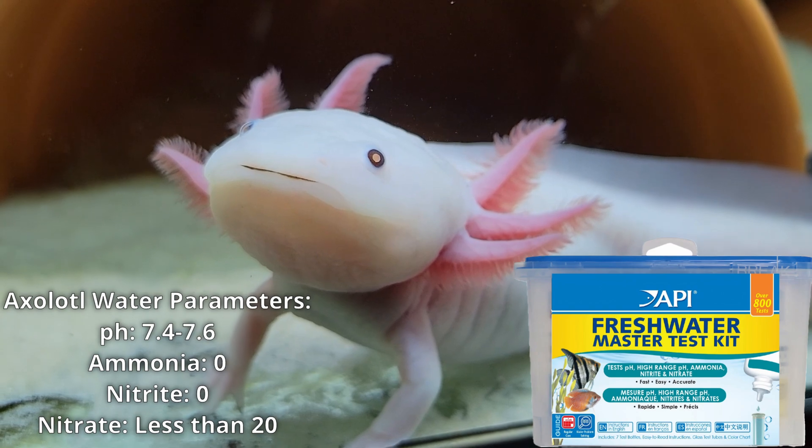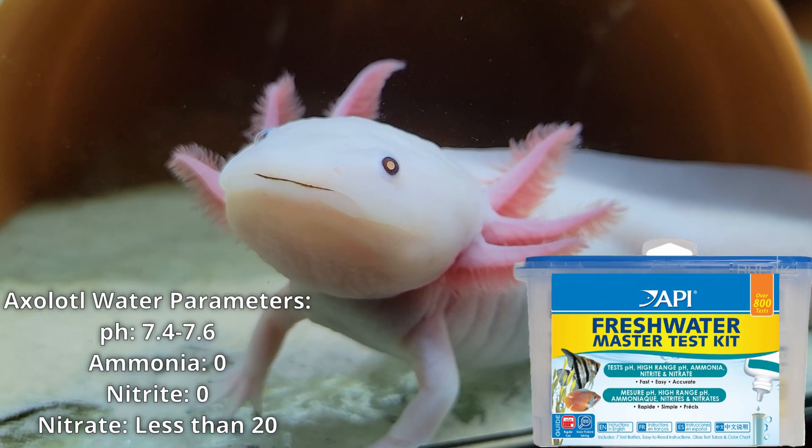It's the freshwater test kit. This is the most accurate one out there.